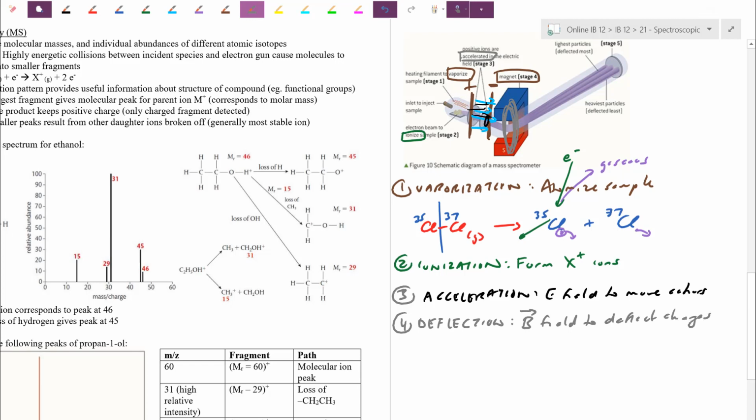And essentially what's happening here is before any magnetic field was on, I had all this velocity going out of the plate here. I'm actually hitting the other side of the container. I'm never actually going to make it down to the detector. You notice there's a nice 90 degree here. So what ends up happening here is as I slowly ramp up the magnetic field, this magnetic field here is going to direct charged particles sort of perpendicular to the rest of the device. At first, the lighter particles are going to experience more of a pull. They're going to be able to make it down this tunnel here. If I'm too heavy, nope, I'm out of luck. I still collide with the far side.